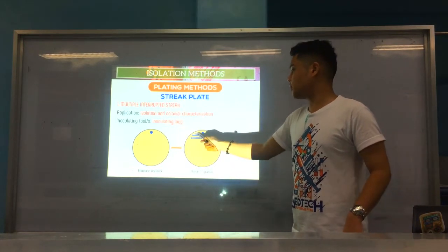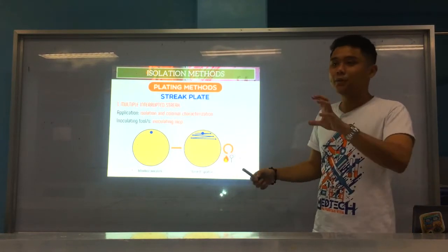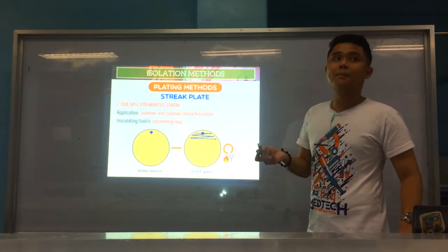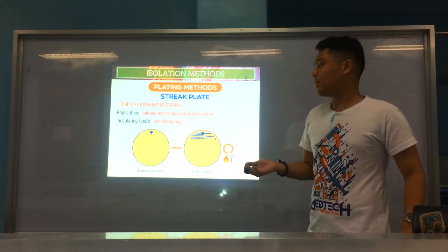So from here you streak the first quadrant, and then after streaking you heat the loop. Okay? That's why it's interrupted. After you streak the first quadrant, you flame the loop. Alright. That would make sure you don't over-inoculate, and also contaminants are prevented.